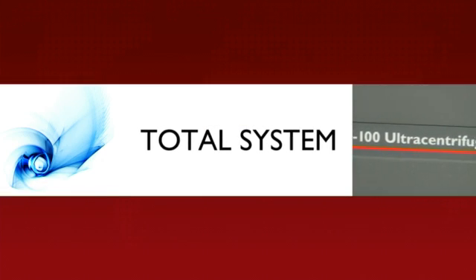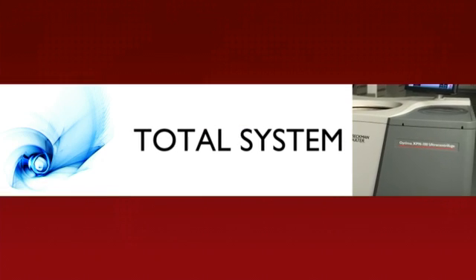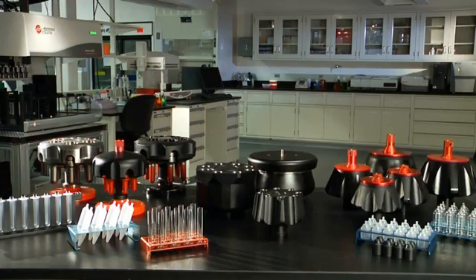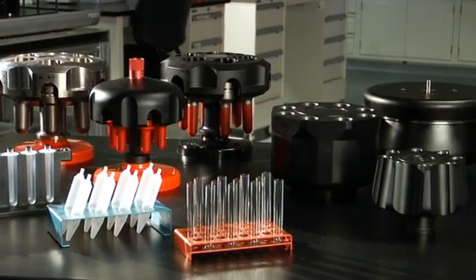When you choose a Beckman Coulter Optima X-Series Ultra Centrifuge, you not only get an industry-leading instrument, but a total system of rotors and labware to support all of your application needs.